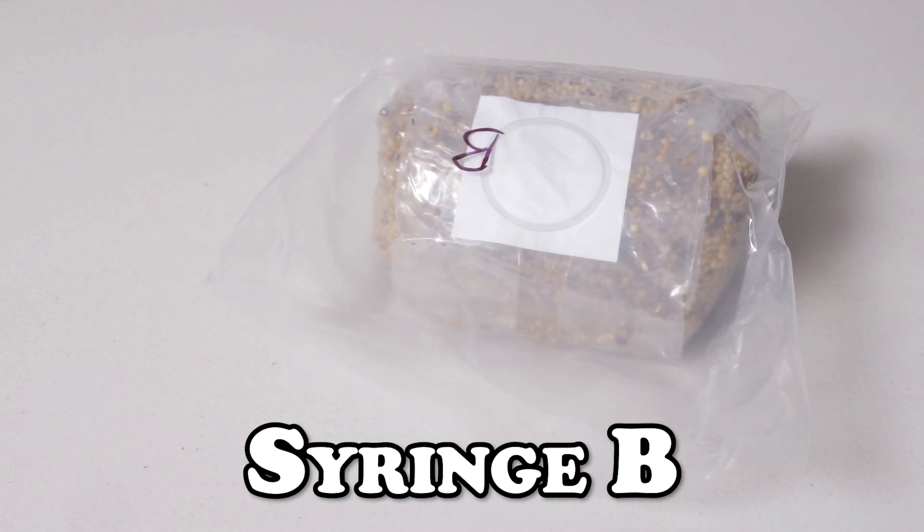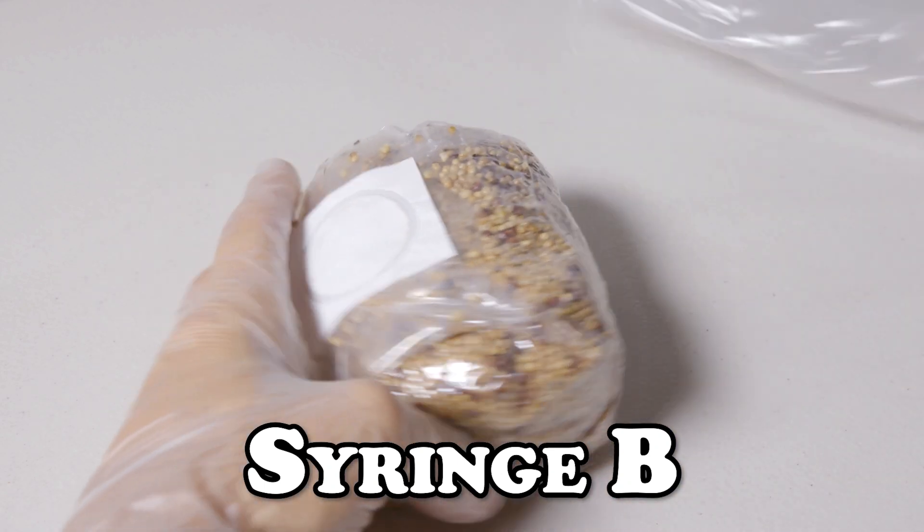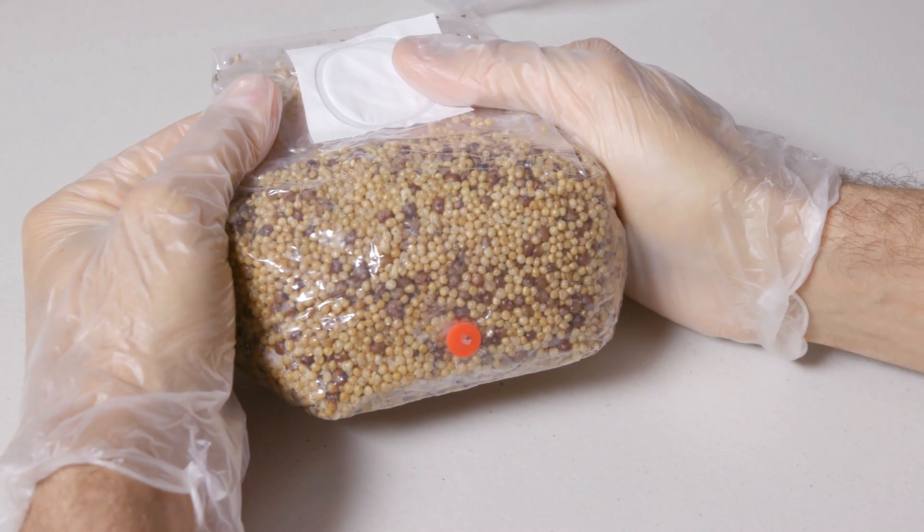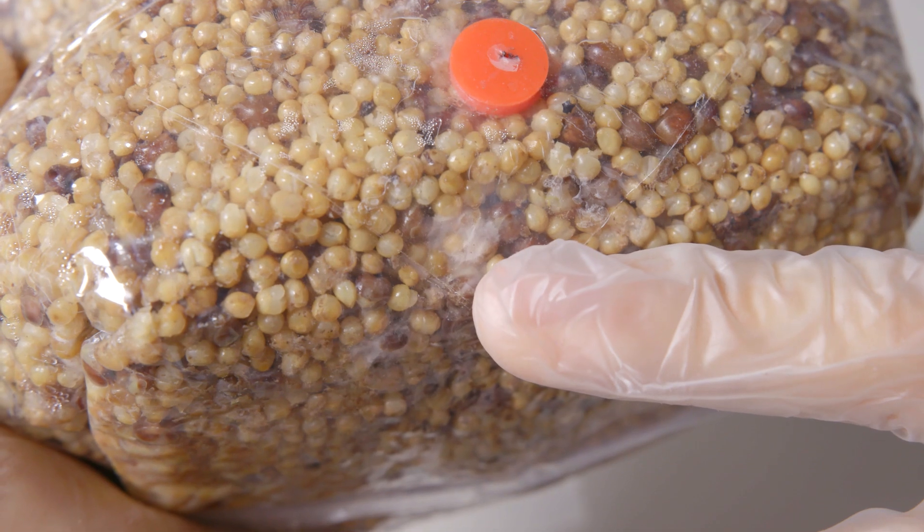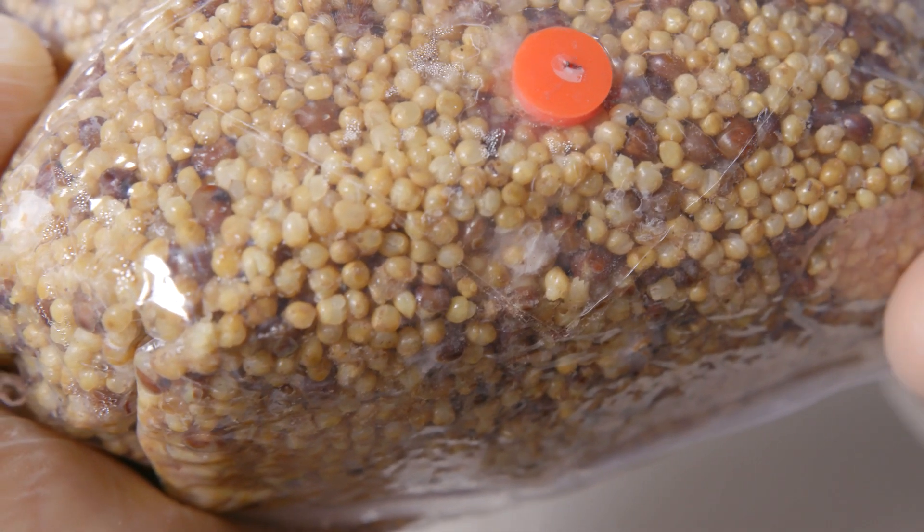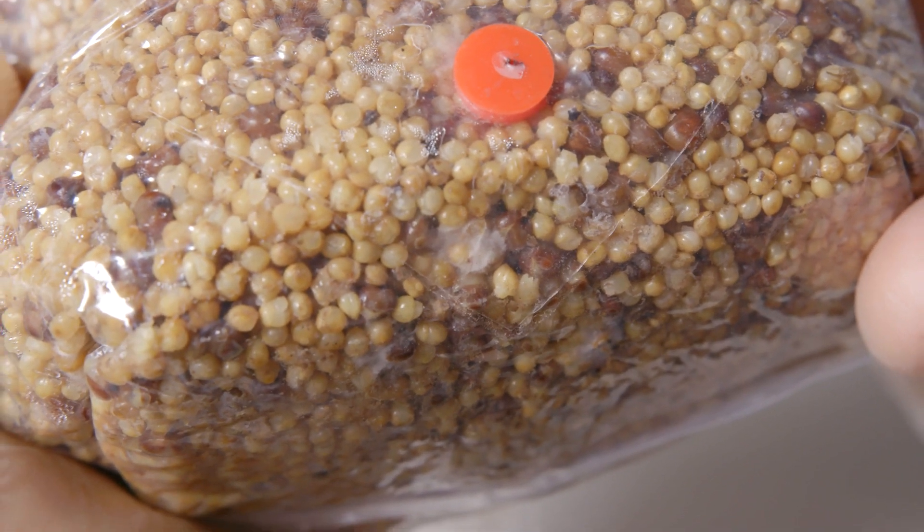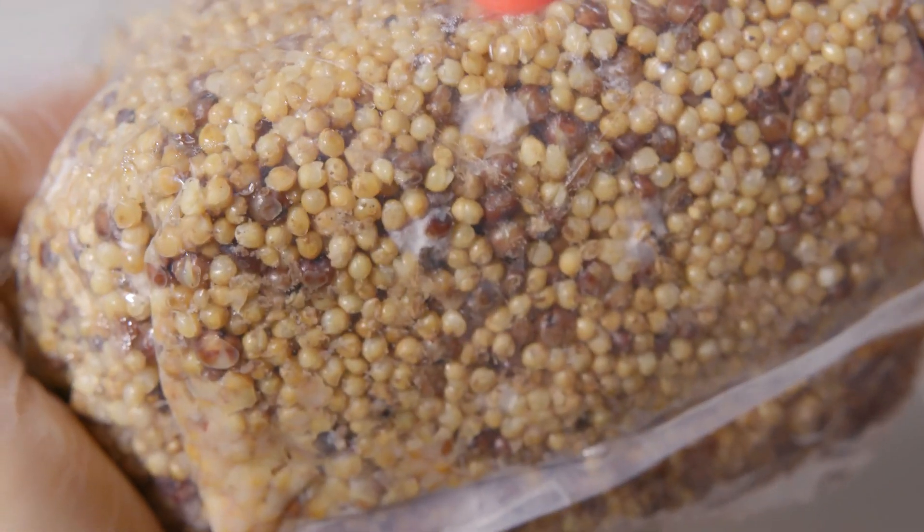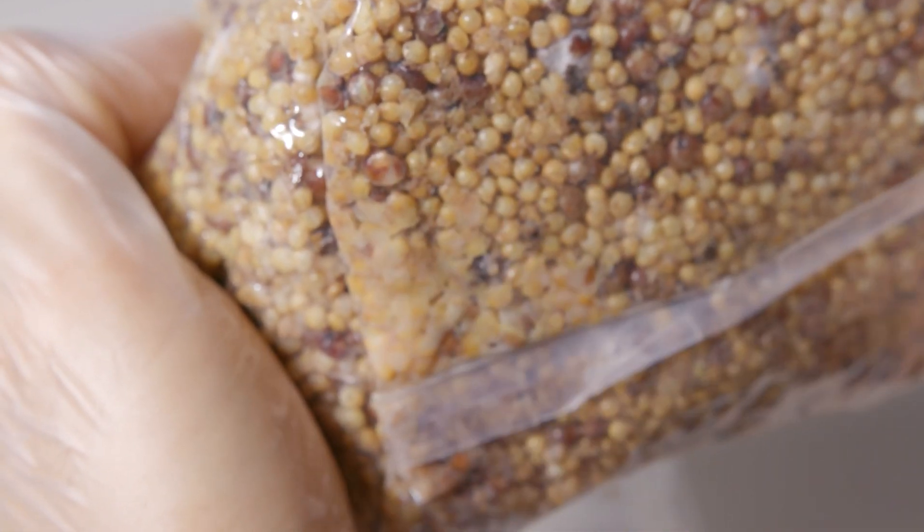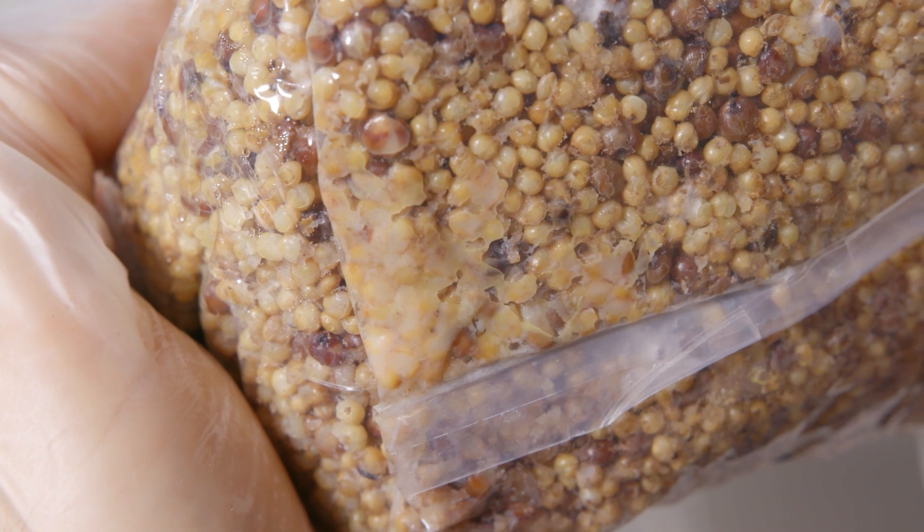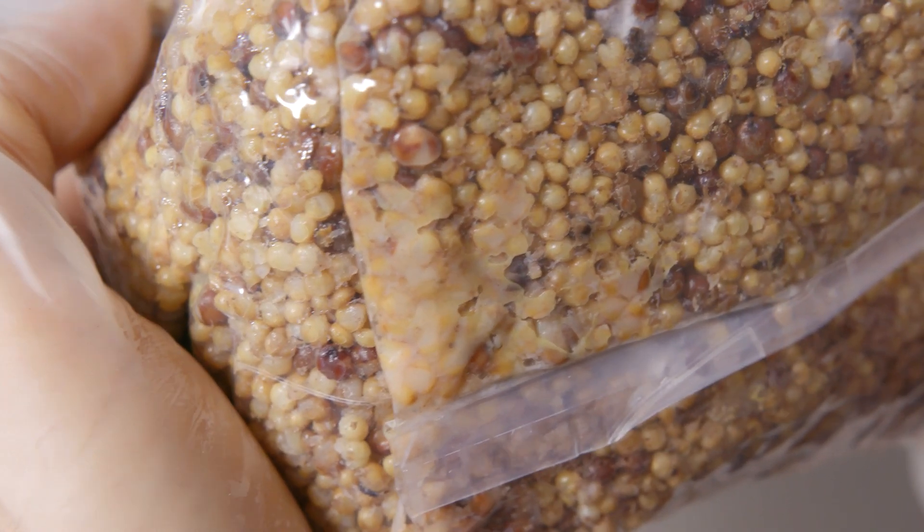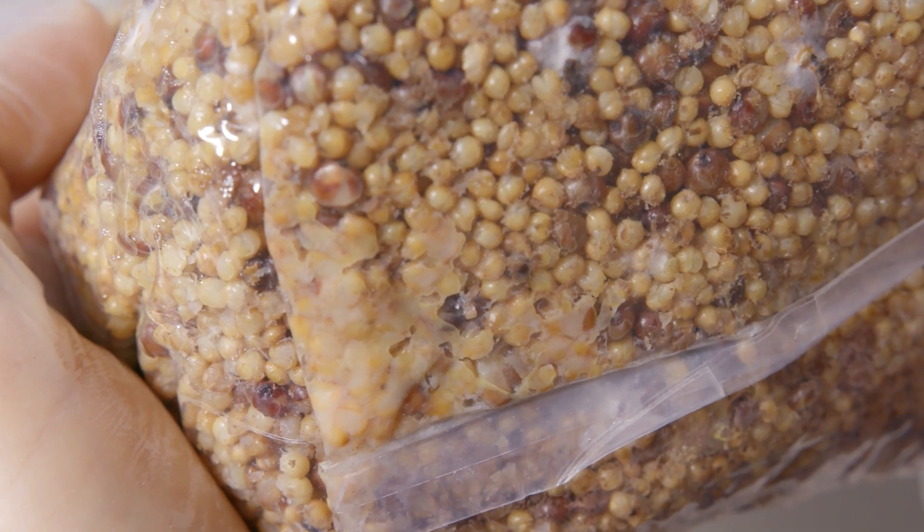Next up we have syringe B. On first impression it doesn't seem like much is happening. We do have a few spots of mycelium developing throughout, although it's a bit wispy and nowhere near as robust as the last bag. Here in the bottom we do have a few more spots forming, but notice on the left the grains have a sheen to them and they're turning a bit mushy, which indicates that bacteria are beginning to metabolize down the grain. We'll leave the bag alone for now and come back to it in a couple of weeks.